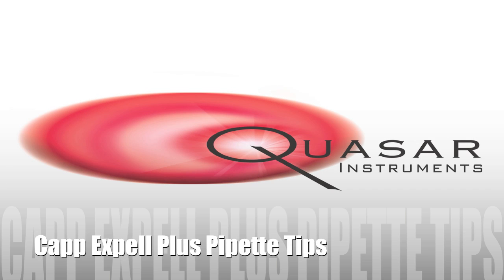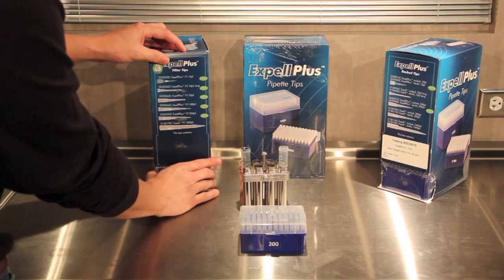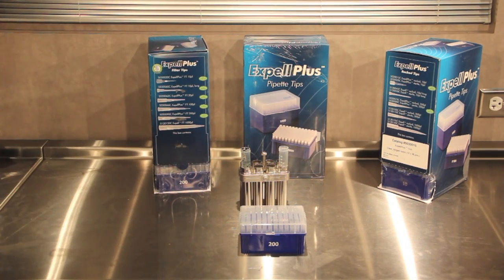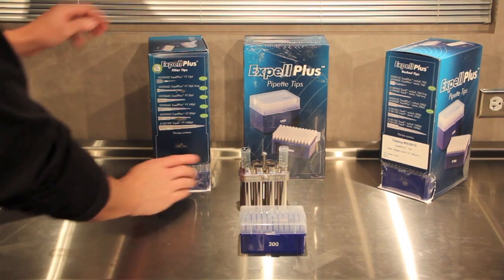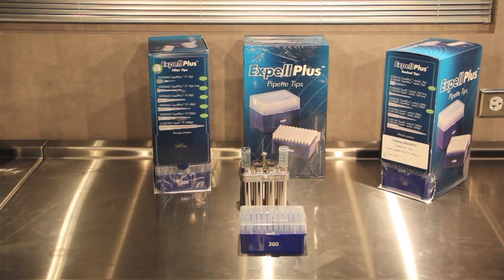In this video, we'll be talking about the CAP EXPEL PLUS low retention pipette tips. Before we show you the low retention characteristics, I want to show you the intelligent packaging that these tips come with. The on-demand packaging system ensures that tips are always ready and available on your bench.